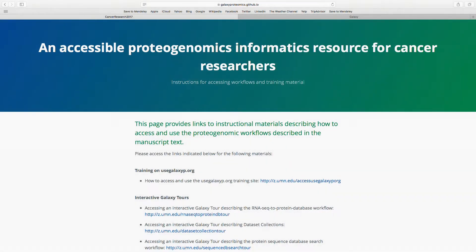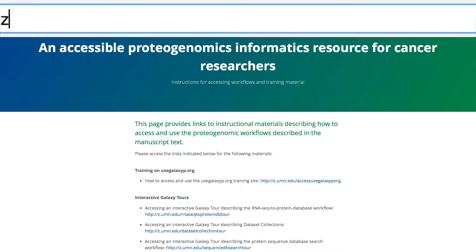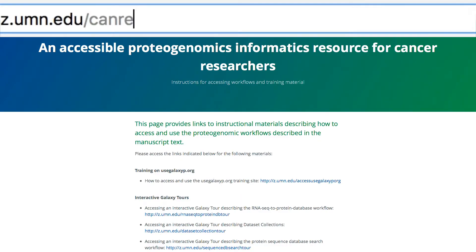The page shown here provides a summary of the instructional material available to guide users through the use of this resource. This page can be accessed by going to z.umn.edu/canresgithub. We will return to this page in a moment to explain some of the instructional materials available.